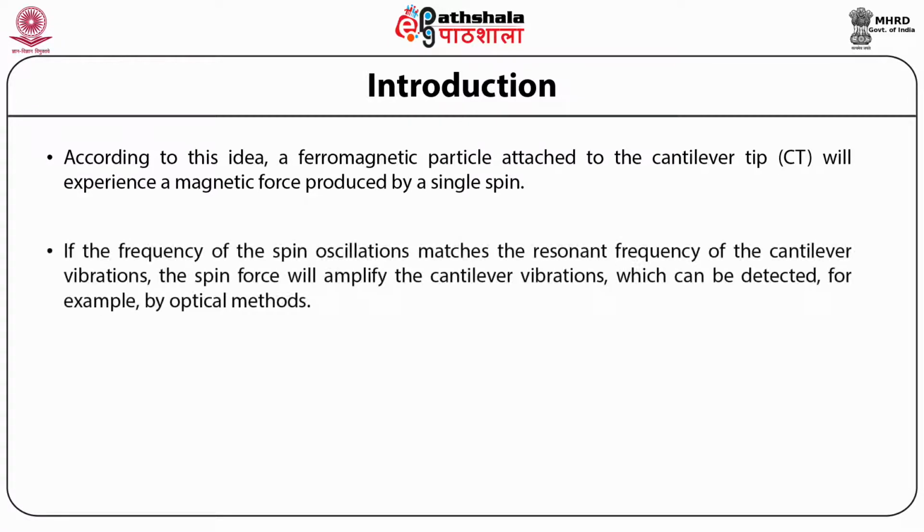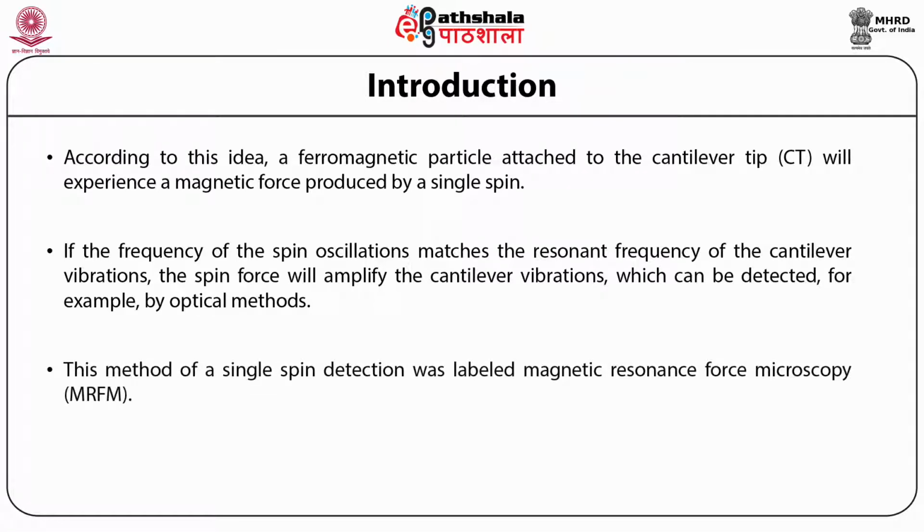If the frequency of the spin oscillation matches the resonant frequency of the cantilever vibration, the spin force will amplify the cantilever vibration, which can be detected, for example, by an optical method. This method of single spin detection was labeled magnetic resonance force microscopy (MRFM).